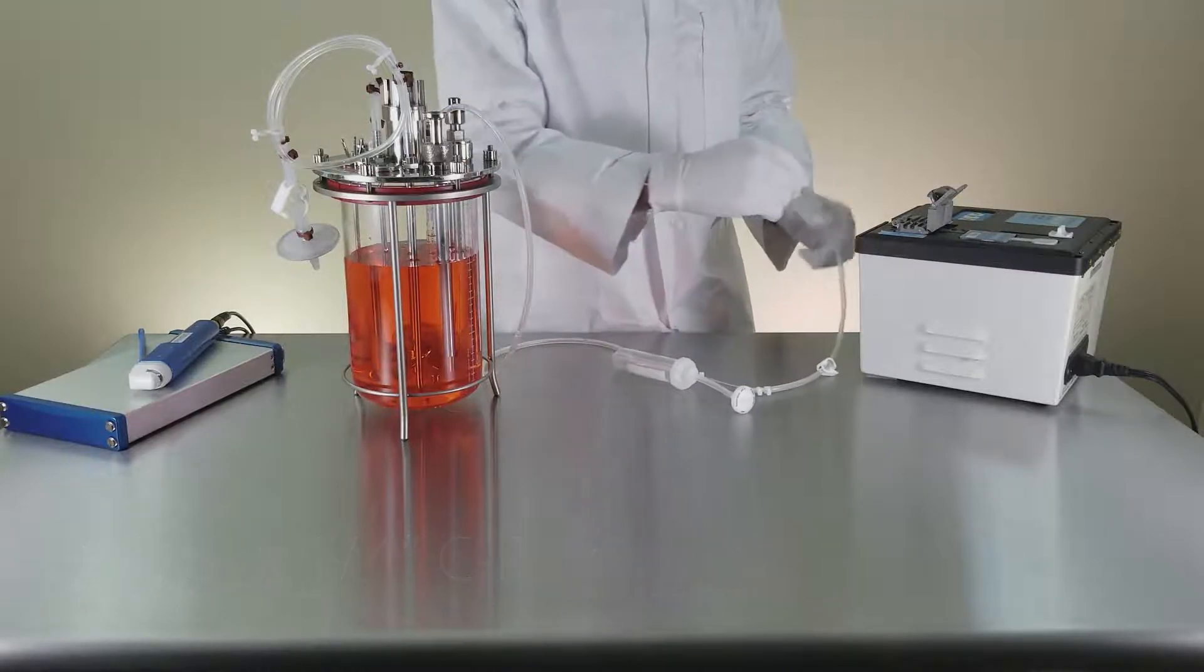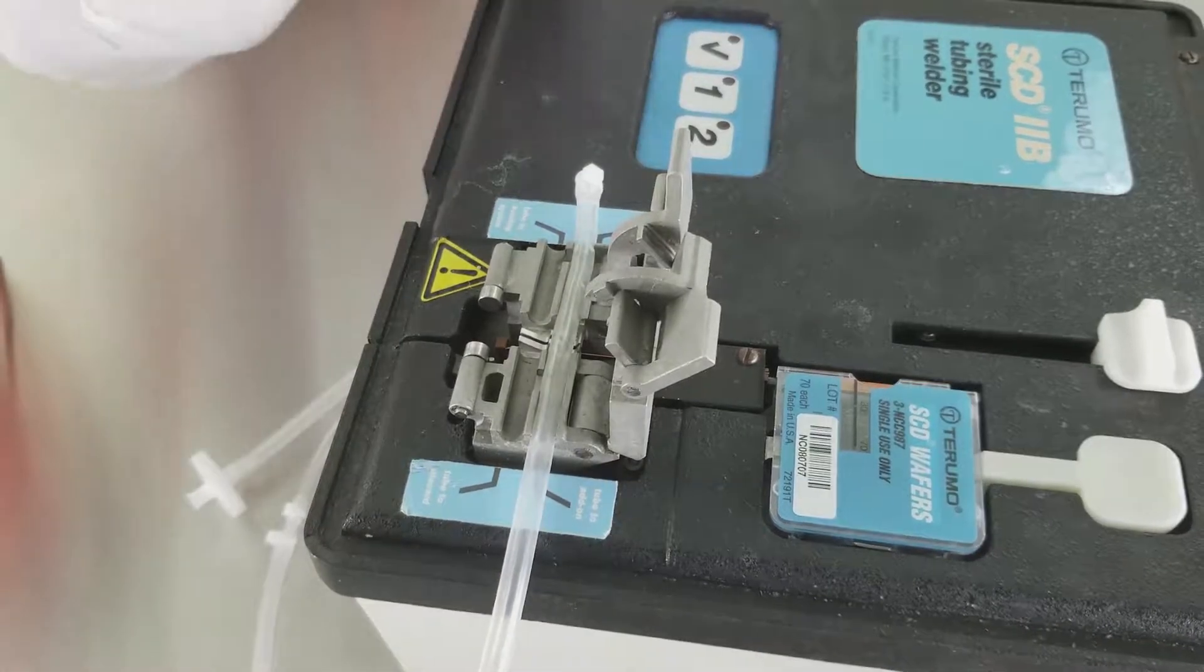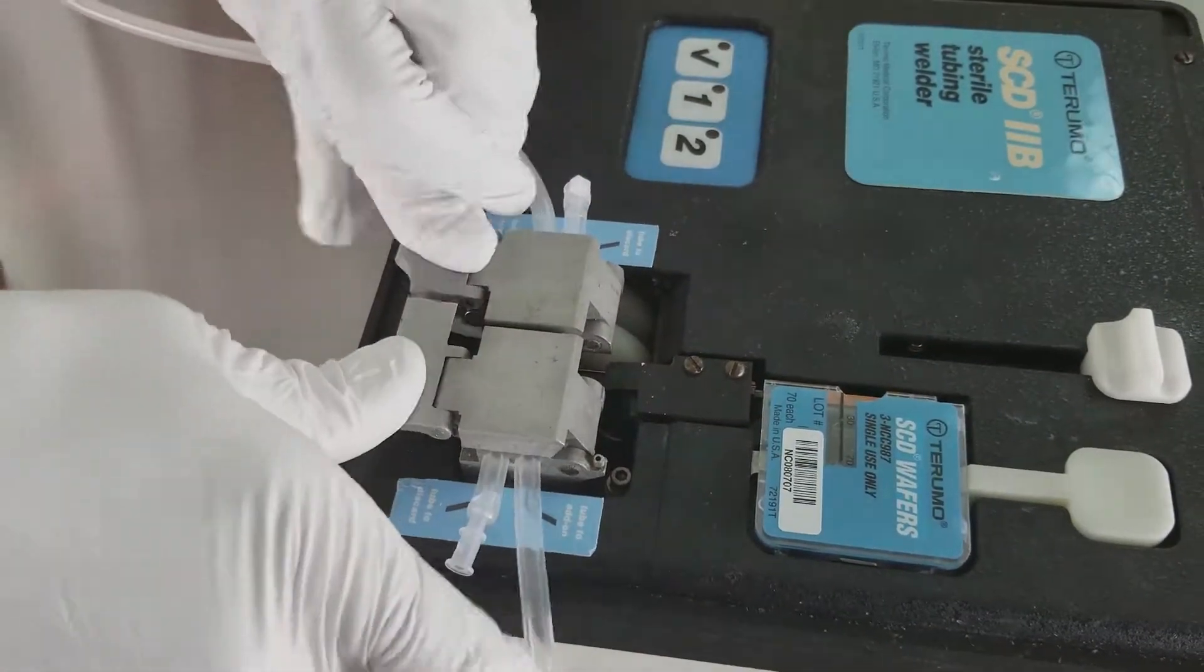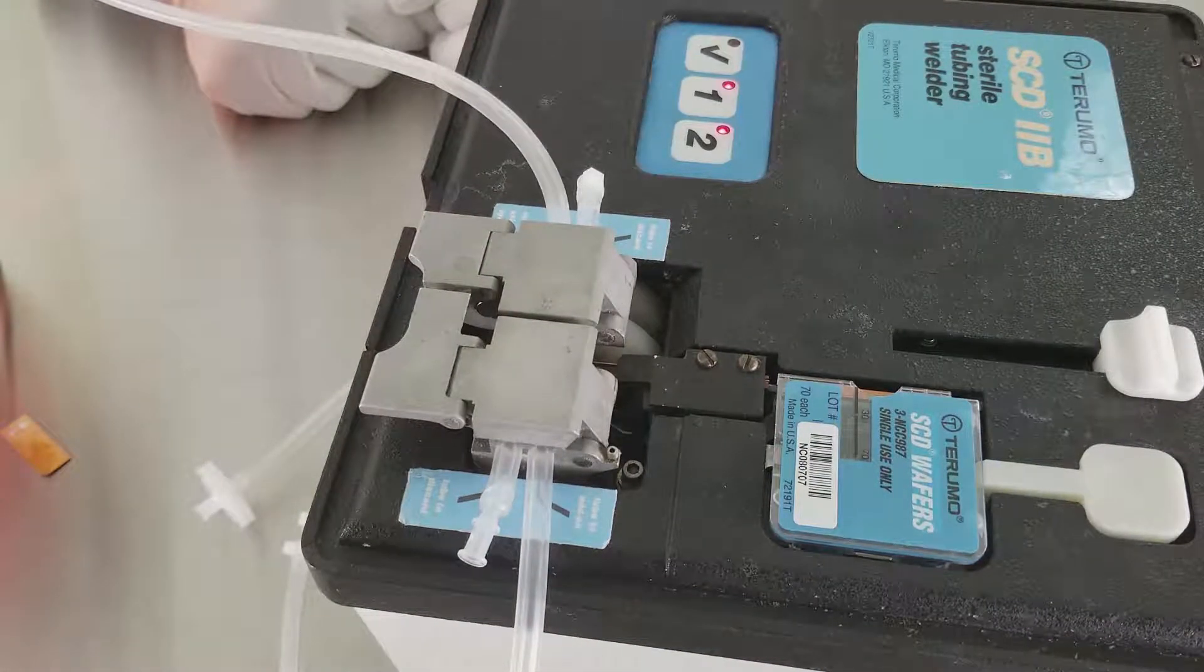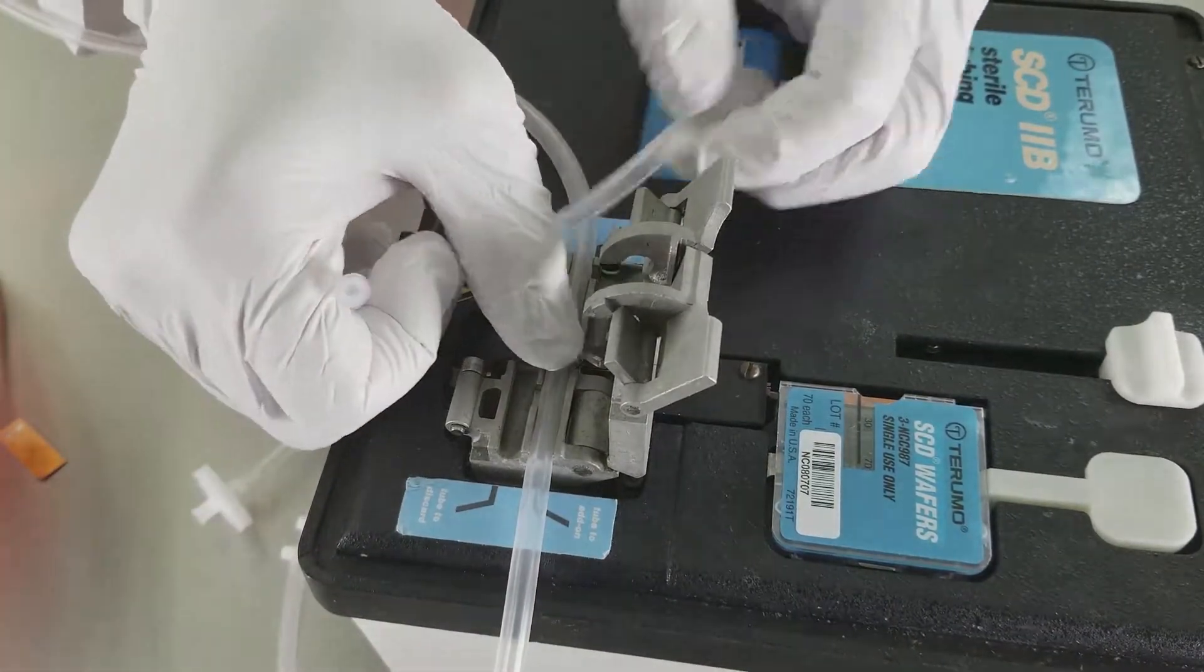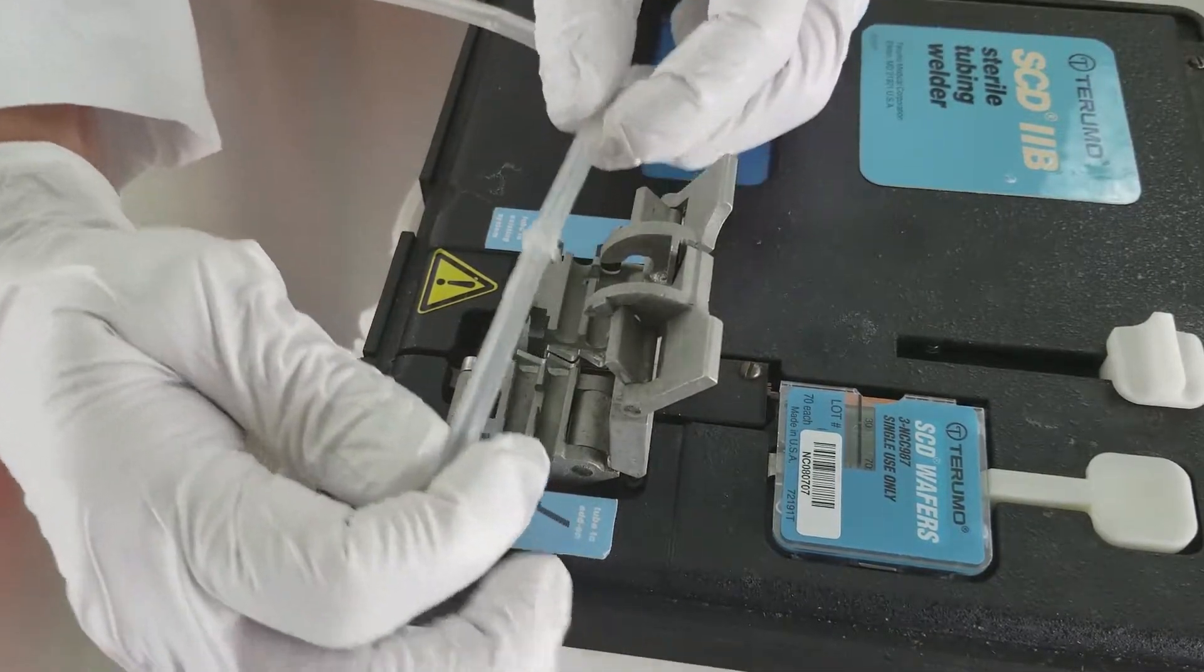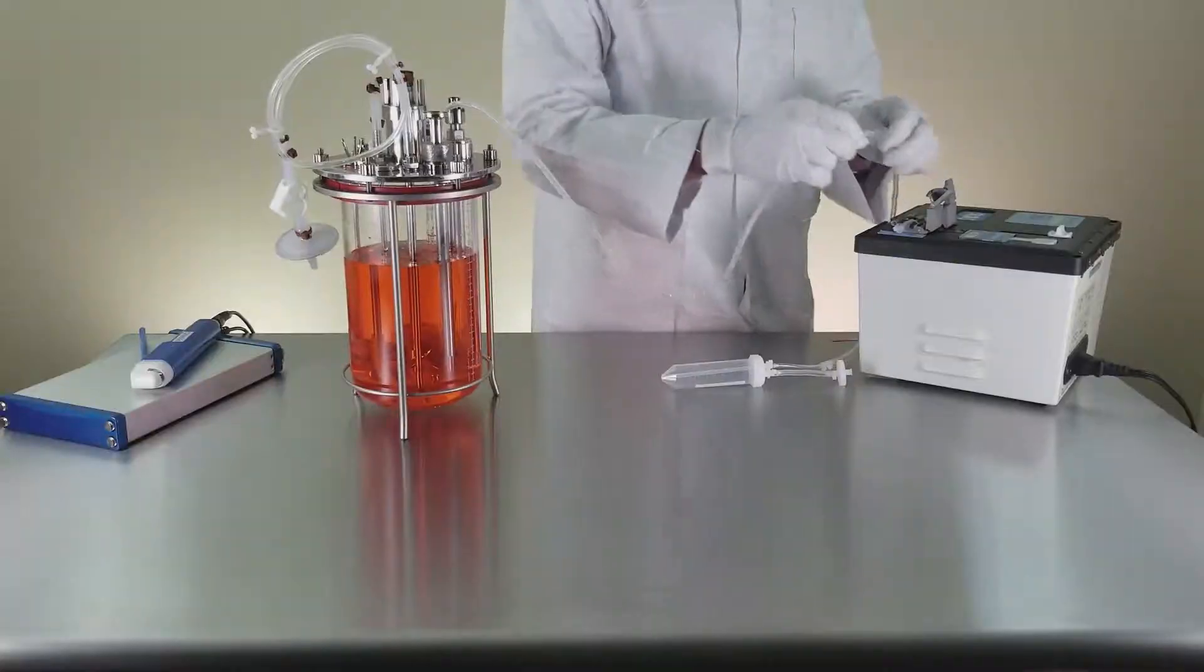Place your tubing into the welder to create a sterile weld of your Omnitop to the bioreactor. Custom connections are available too. Check the weld to make sure you made a good connection to the vessel from which you want to sample.